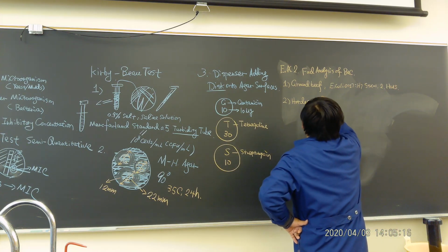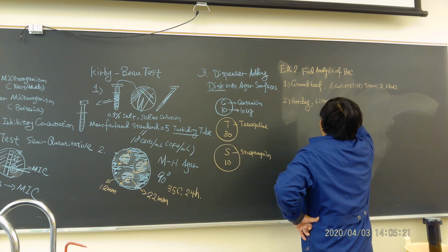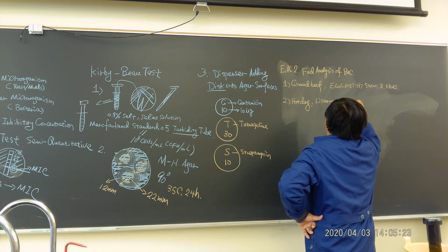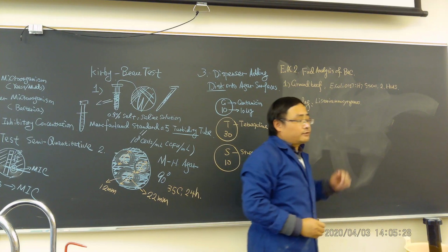Hot dog, we care about Listeria monocytogenes, because that's a major risk and causes lots of outbreaks.